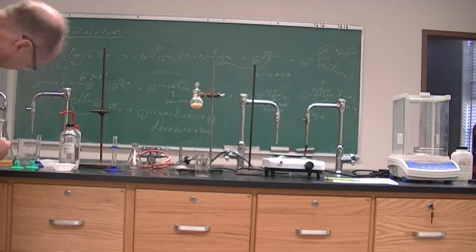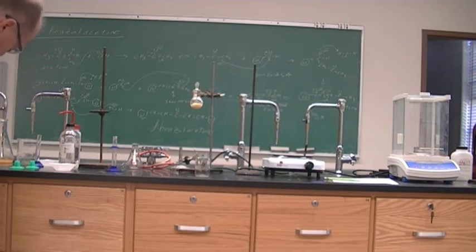So by the melting point, we know that we have a pure, both trans isomer of this dibenzalacetone. And if we took the NMR, we would see a large coupling constant, usually around 15 to 17, for the hydrogens being trans. You can also look in the fingerprint region of your IR to see that it is also both trans. But we have a melting point.